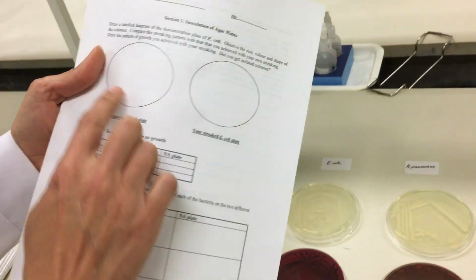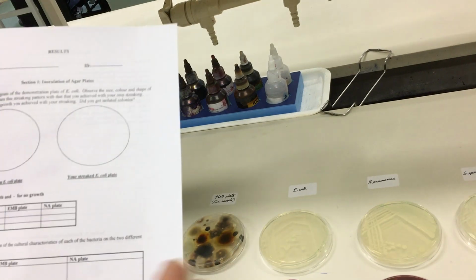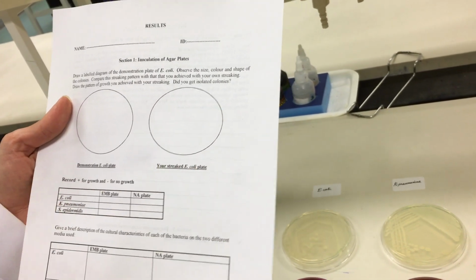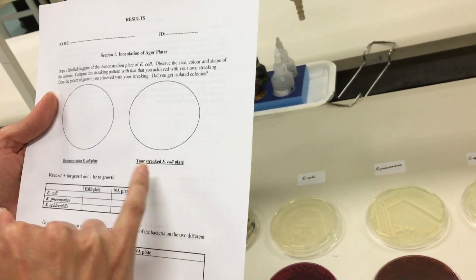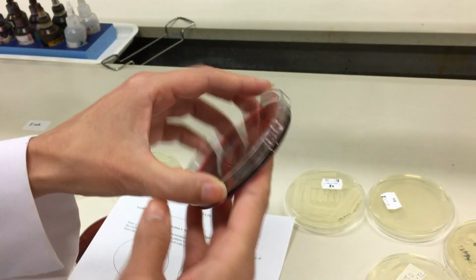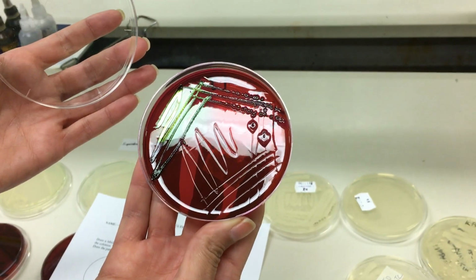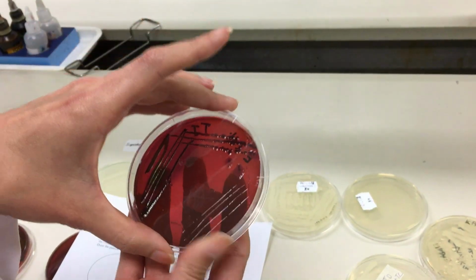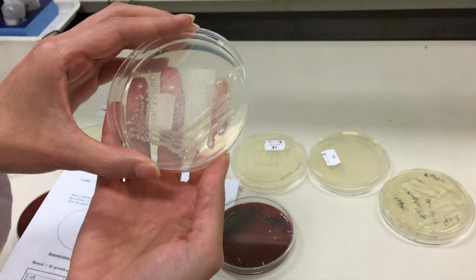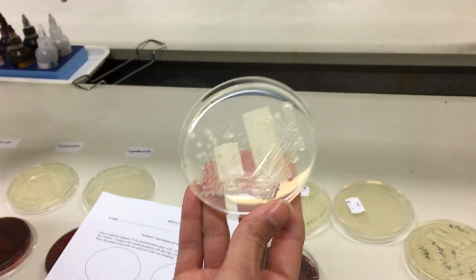So you can just do it here. And then this is the demonstrated one, so the good example, and you're supposed to do something that you have done. Because you can't really compare, I just want to show you some of the not good results. So you can see there are some problems with this streaking. So you can show some of these bad examples. So in section 1, you can come up with the good example and bad example to demonstrate what you're expecting. So you can compare this one with the one that I show you.